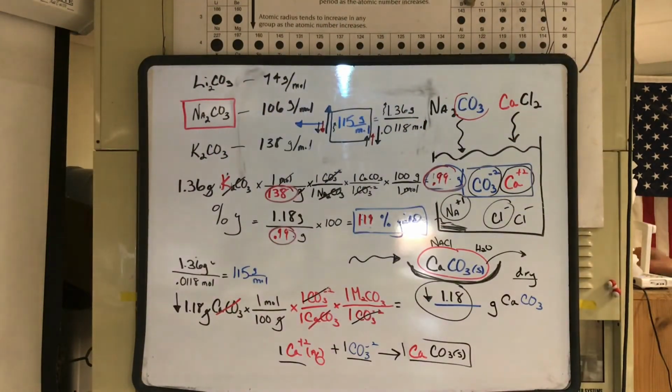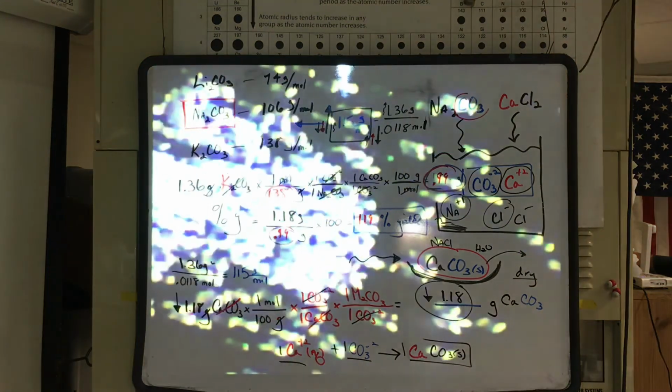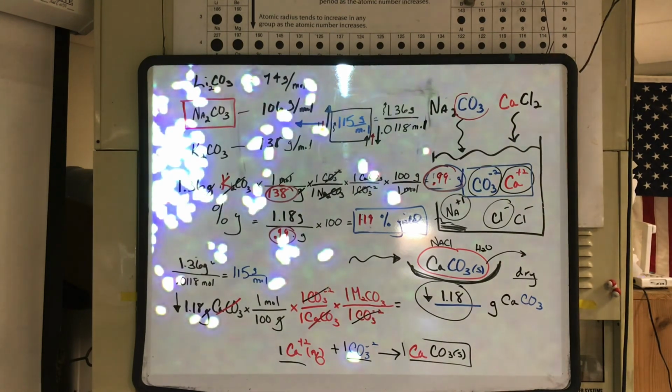So what I'm going to do here is put up the crystals, and this is crystal A. So this is what we had in the video. I don't know if you can see some crystals here, but I'll move that over. And so there are some crystals right there. And then we'll go to the other solid.